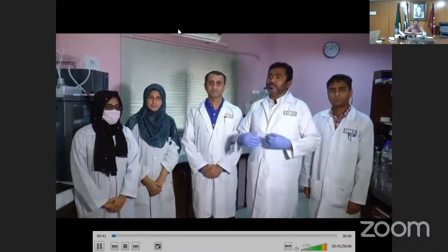If you have this video and you have a Waters HPLC, because there are many kinds of HPLC, the basic function of the HPLC software is the same. So for this presentation, we are going to demonstrate the Waters HPLC.